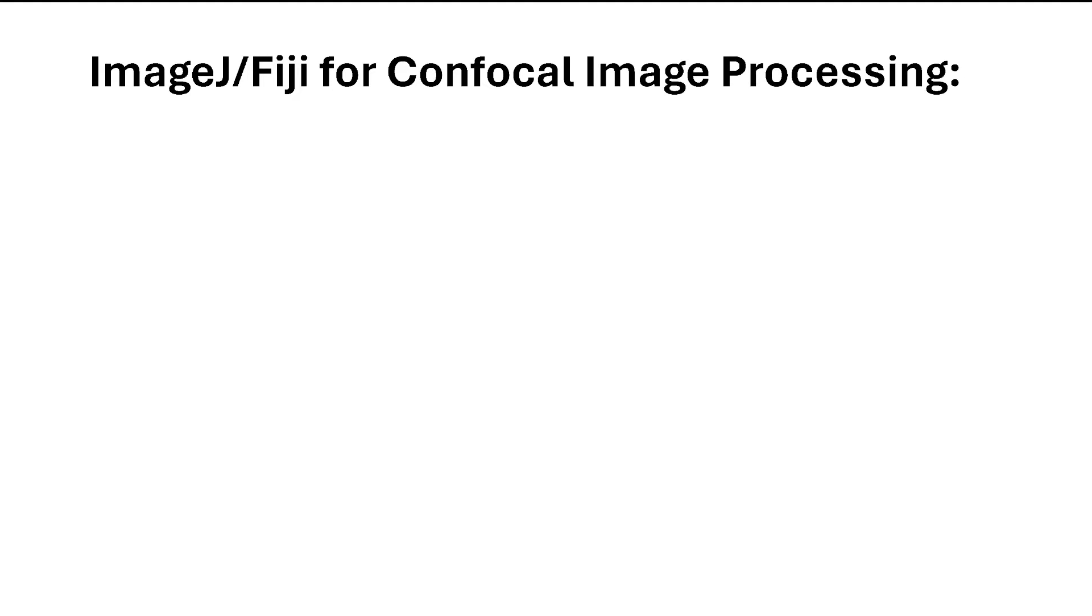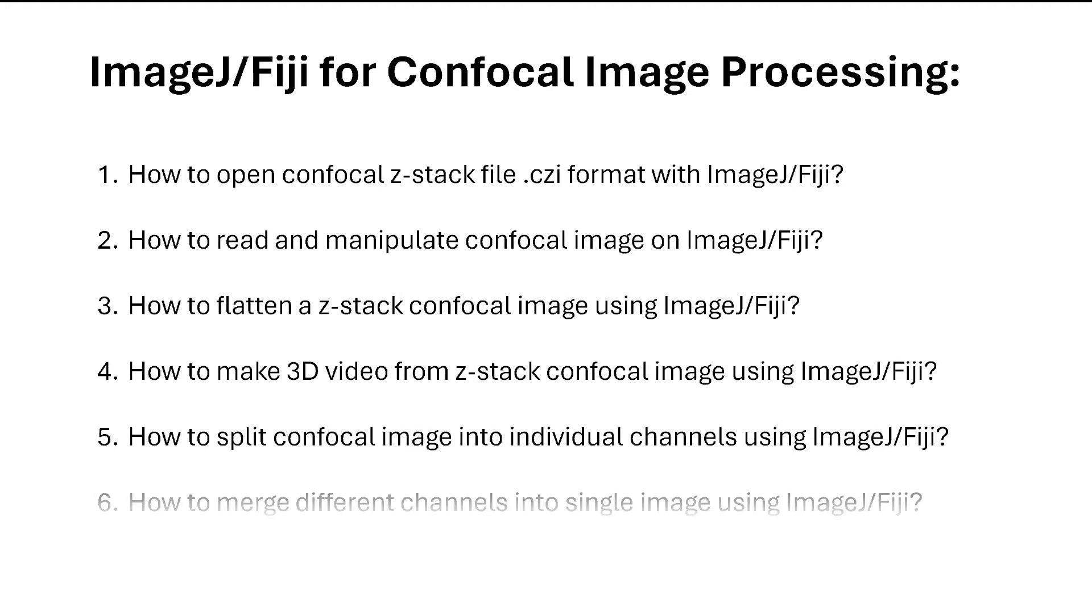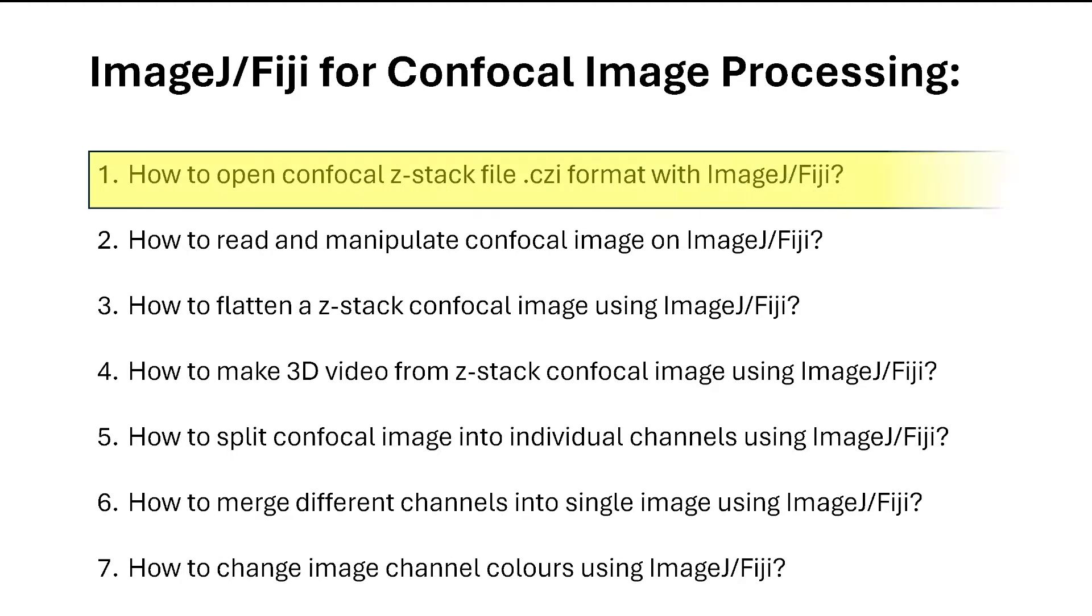Hello, this is the first video of the series ImageJ/Fiji for Confocal Image Processing. I will go through various topics in this series, but in the first video I will talk about how to open confocal or z-stack files in CZI format with ImageJ or Fiji.